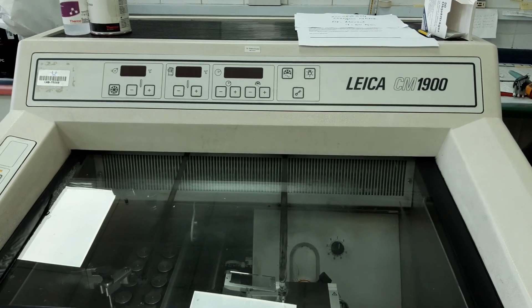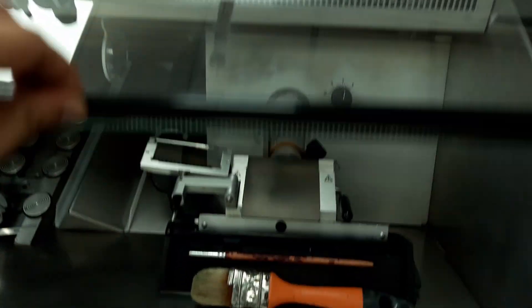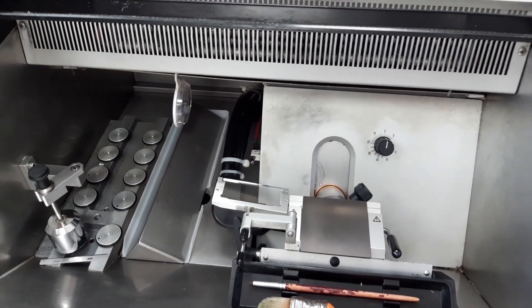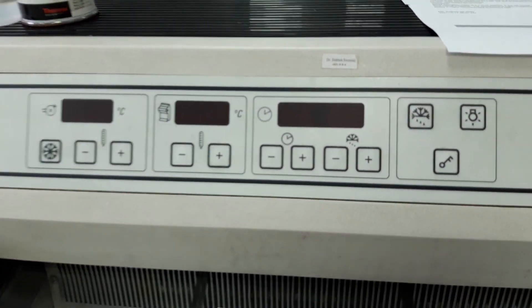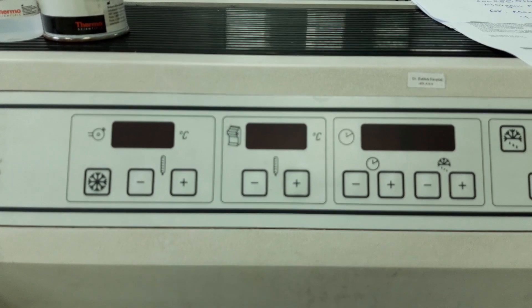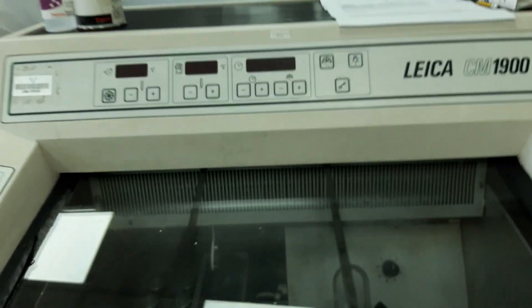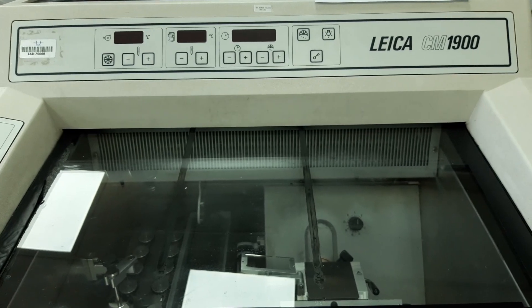Okay guys, here I have a cryostat and the problem with this one is the compressor is getting hot and the temperature doesn't go down to the desired setting that the user wants. So let's check the back side of this one and I will show you what the problem is.